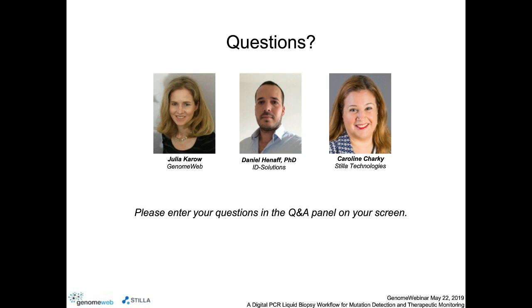Okay, thanks. That's great to confirm. We actually had one question asking whether the ID Solutions kits are CE-IVD marked, but I guess they are not at this point. They are research use only, correct? Yeah, correct. To get our assays CE-IVD marked, we need to release them to make sure that they work well, that they are repeatable and reproducible, and to generate data on real samples to make sure that the assays are correct before marking them as CE-IVD.